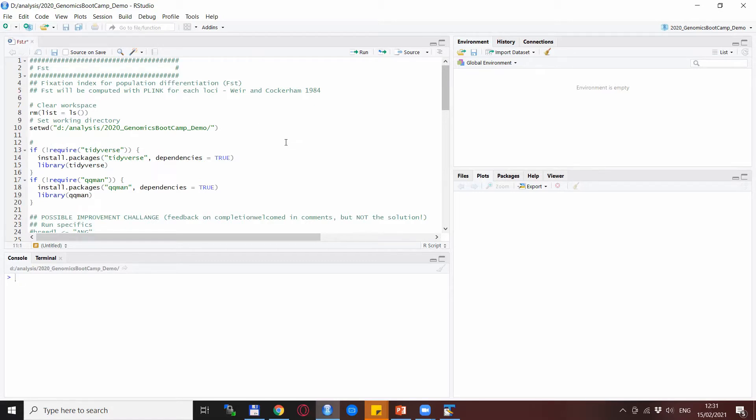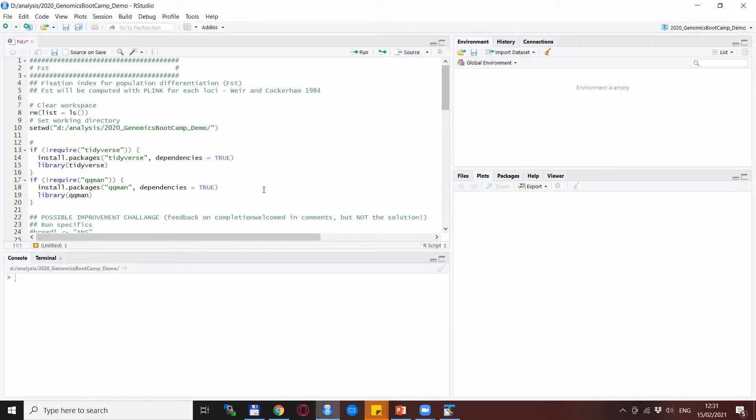We will use two packages in this script. One of them is tidyverse and the other one is a new package called qqman—well, it's not new in the sense that it was created recently, but new in the sense that we haven't used it in the channel yet.